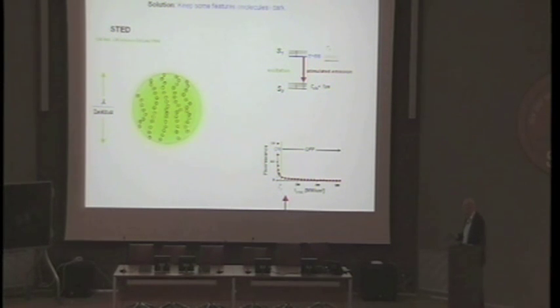And we have to fulfill this condition. One condition is, I said, the wavelength. The other one is the brightness of the beam, and this is shown in here. So if the red beam gets brighter than this value, which I put here as IS, then you can say the molecule is turned off. It's not capable of sending any light back to the detector, because as soon as it gets up, it's instantly sent down to the ground state.